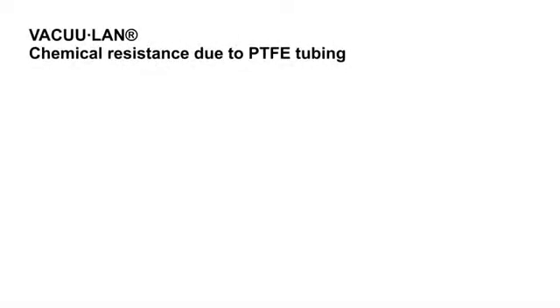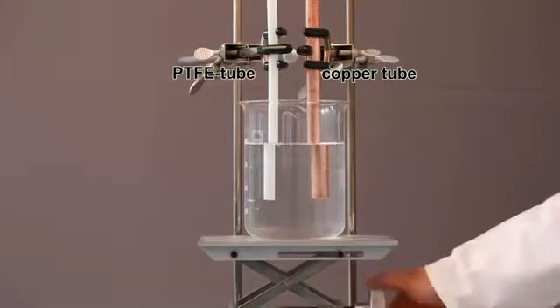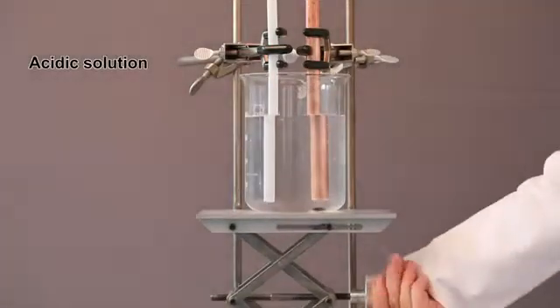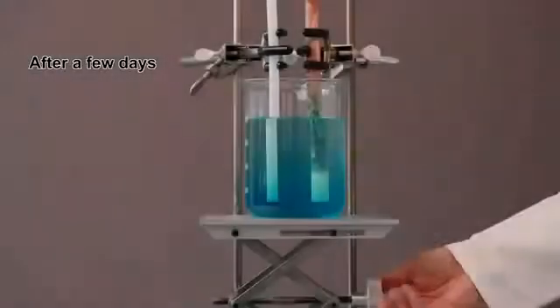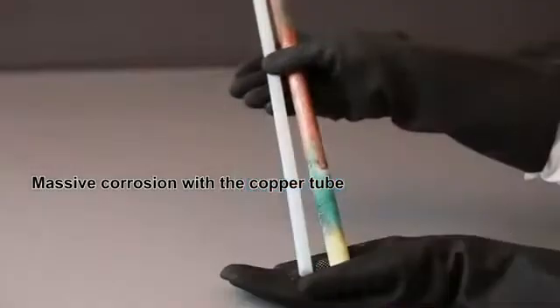VacuLan offers unparalleled chemical resistance due to its PTFE tubing. A PTFE tube and a copper tube are inserted into an acidic solution. Massive corrosion occurs with the copper tube after only a few days. No effect on the PTFE tube.